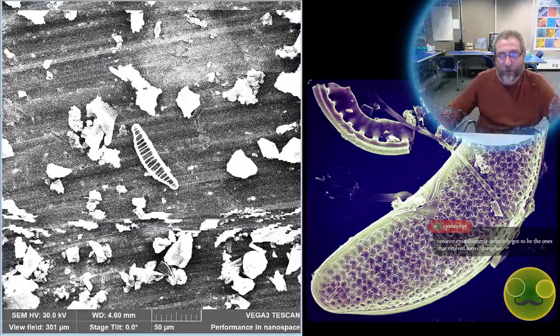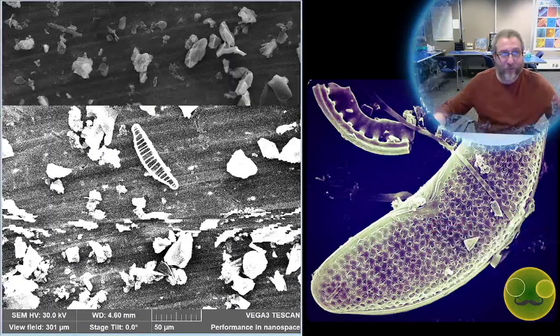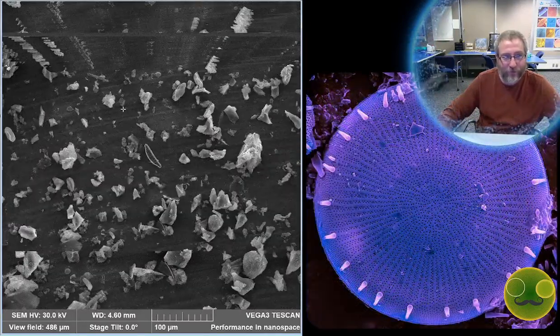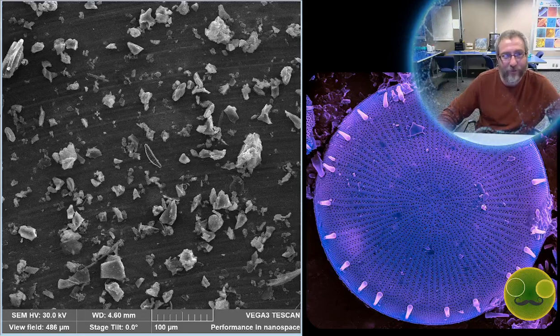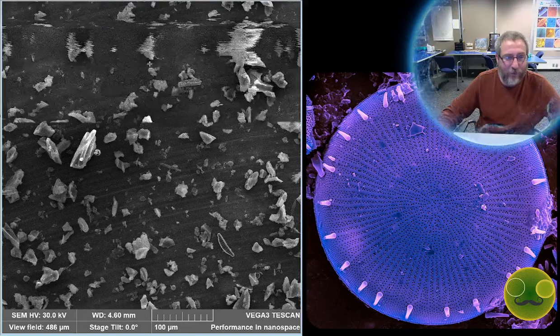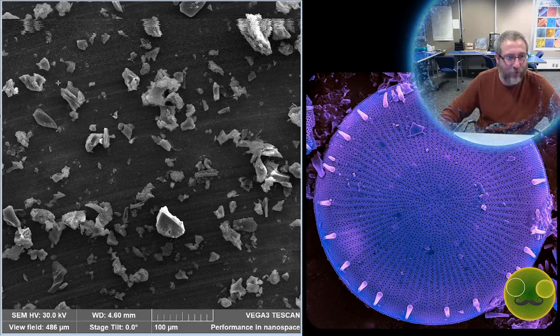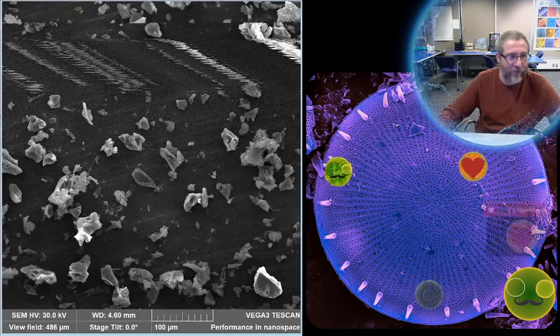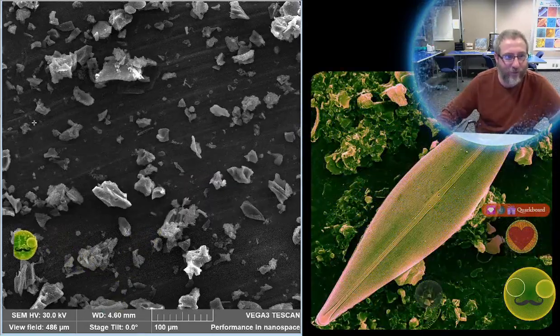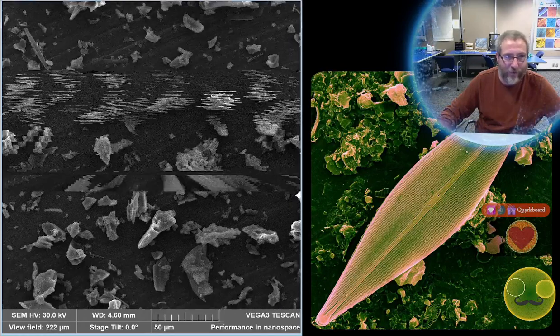And so there's a value to it for them in that they are in a reducing environment inside the diatom, basically. And it allows them to conserve some of their energy for other things rather than making this mucilaginous sheath, which can be problematic for them. So I suspect that's part of the reason, not just that they are giving them a home, but they are creating an environment that's helpful for them, that means that they don't have to utilize some of the energy that they are making to do something that they don't want to have to create.